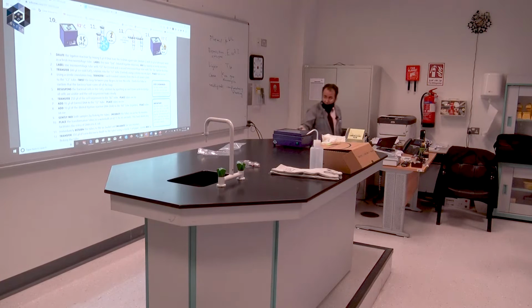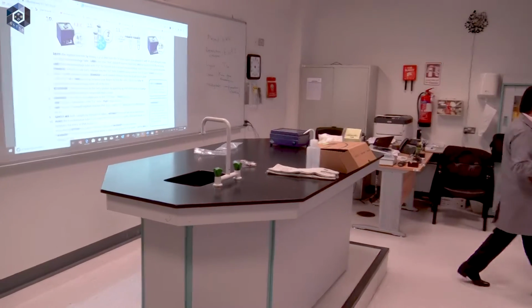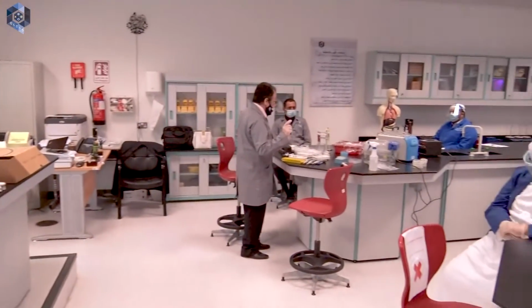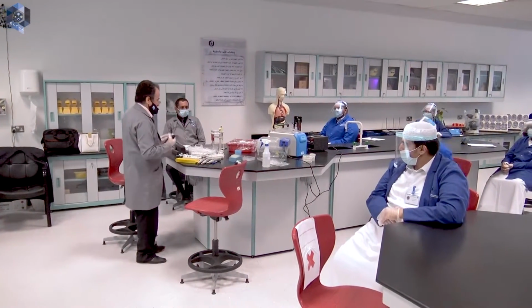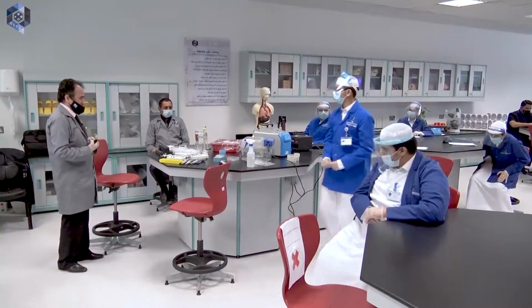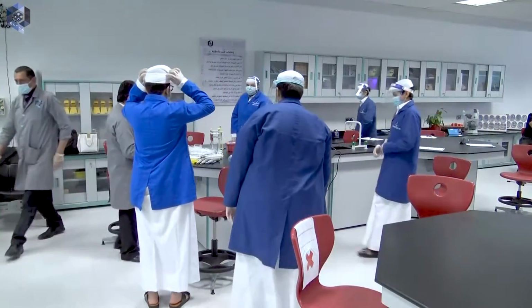So far we started preparing the DLR tubes, right? We prepared the first DLR. Who was responsible for this step? Who made the labels? The DLR, Tamimi. Yes, can you please join me here in this station? But keep distances, okay? Keep distances.